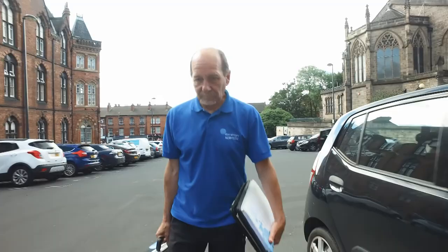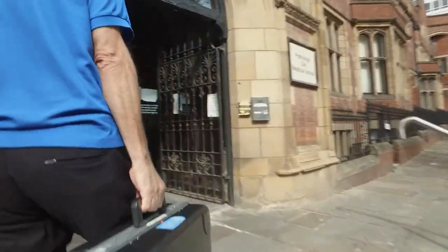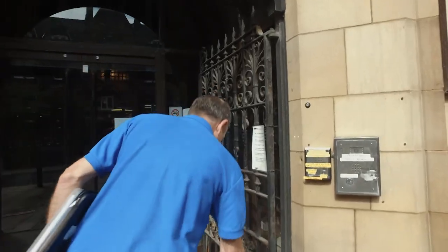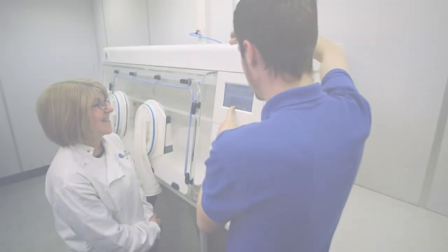With a dedicated team of Don Whitley scientific service engineers and factory trained distributors around the world, we can ensure you will always be satisfied with the performance of your hypoxic station.